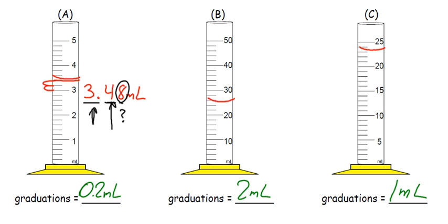Look at B. I know B is 20, and then this would be 20, 22, 24. So 26 is right here, but it looks like it's just below 26. So I would go probably 25. That's pretty certain, but it's not exactly 25, because 25 is in between these two right here. So let's say 25.5.